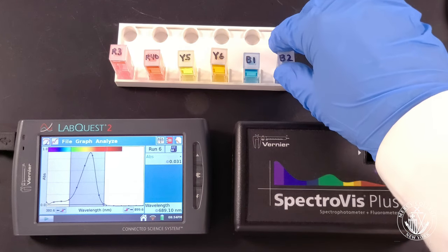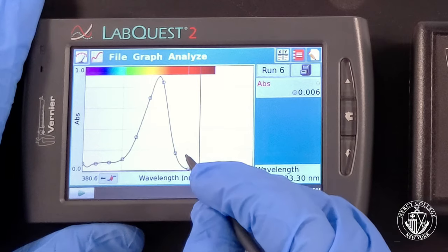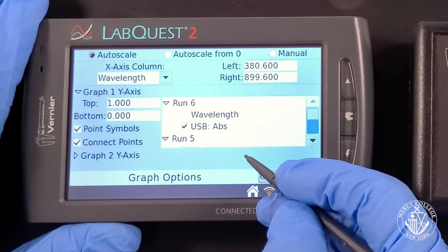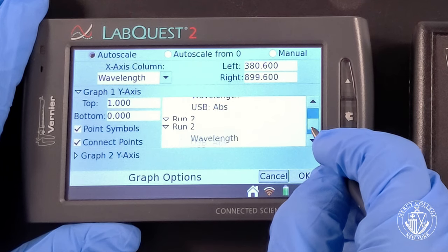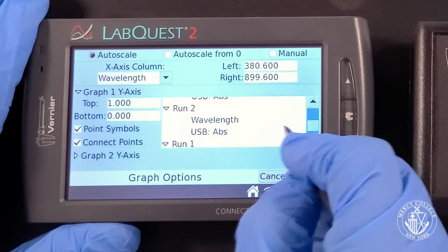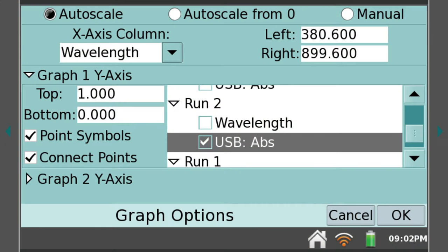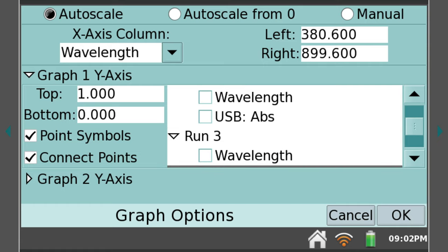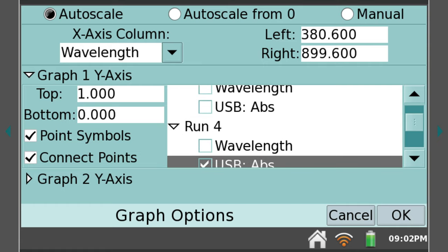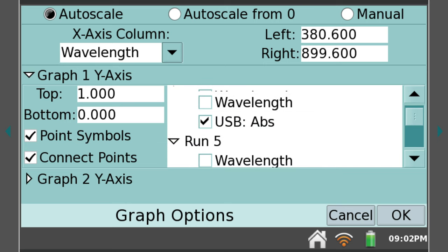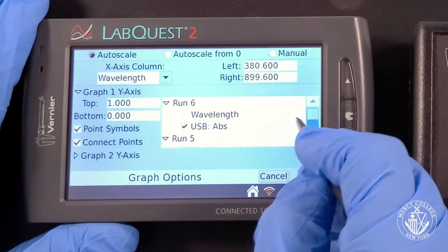To examine all six spectra side-by-side, we select Graph Options from the Graph menu. Then we select each of the absorbance spectra that we wish to display. We'll select runs 1 through 6. We can deselect point symbols to make the graphs clearer.